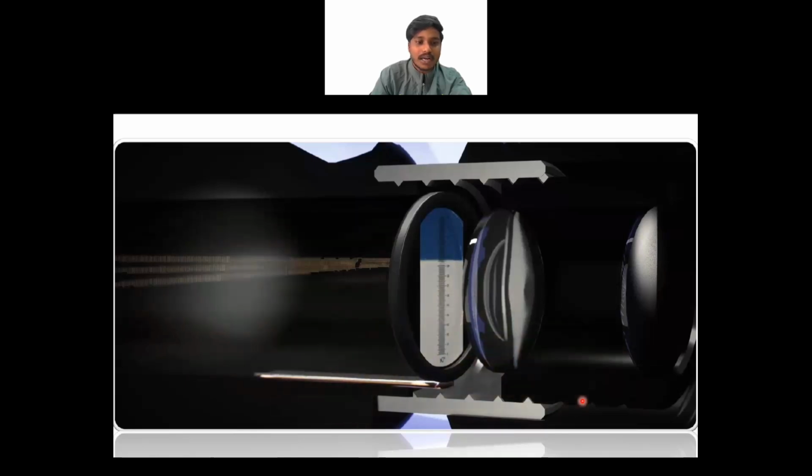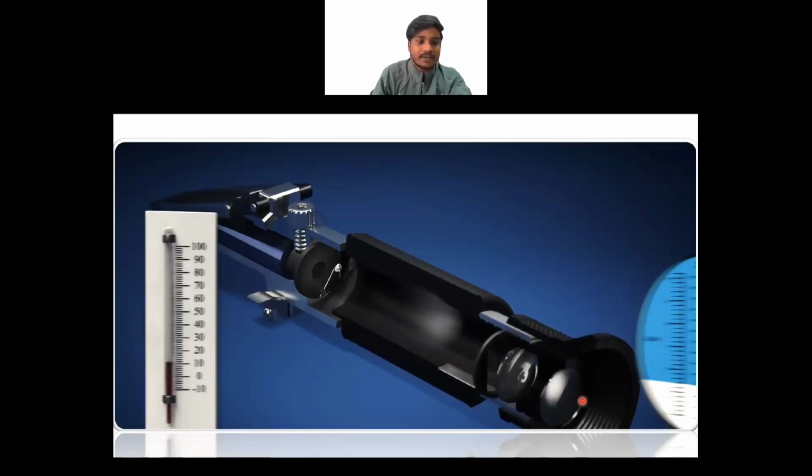For example, the higher the sugar content, the more the light is refracted. And if you measure the same liquid at different temperatures with a refractometer, you will get different results. The temperature therefore has an influence on the accuracy. To compensate for this difference, there is so-called automatic temperature compensation, also called ATC. The measuring scale is mounted on a bimetal depending on the temperature. The bimetal aligns the scale accordingly.